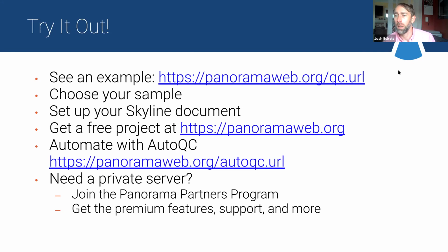Yeah, and you could totally look at the ppm error in a DDA analysis to get some of these metrics too. This is just a more automated, one-stop shop to get those metrics, rather than doing your DDA database search and then pulling those metrics out of your data, or using an Excalibur template to do that manually. This is just an automated way of doing that using free software that already exists.